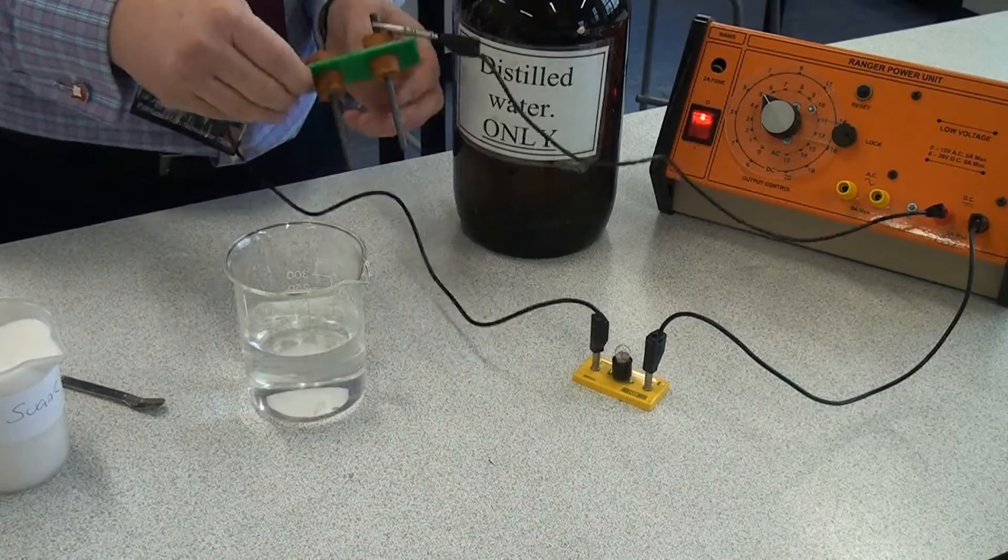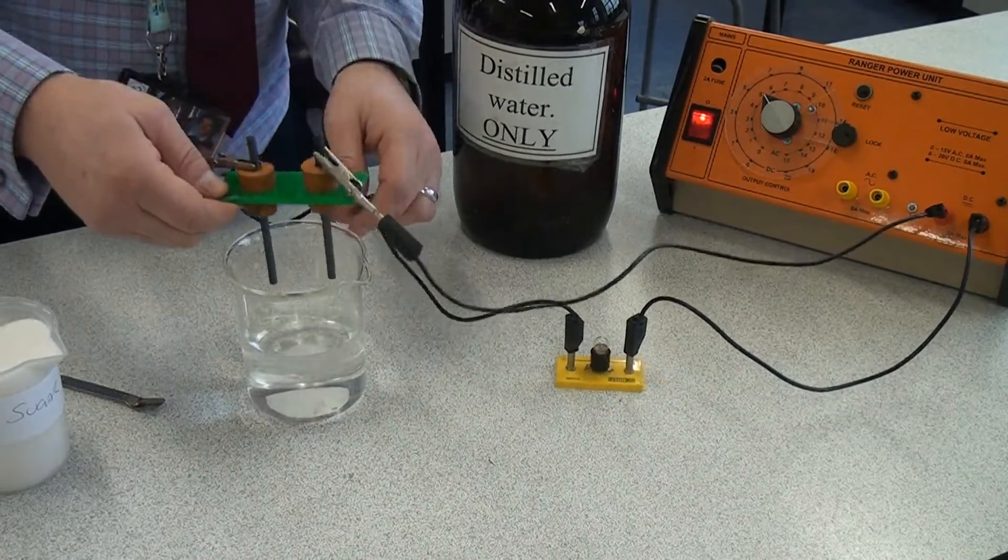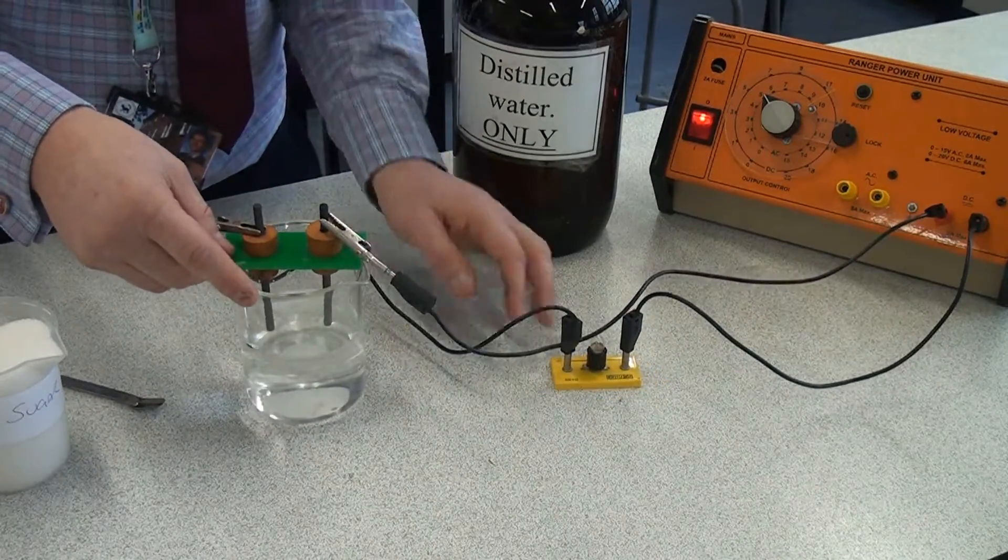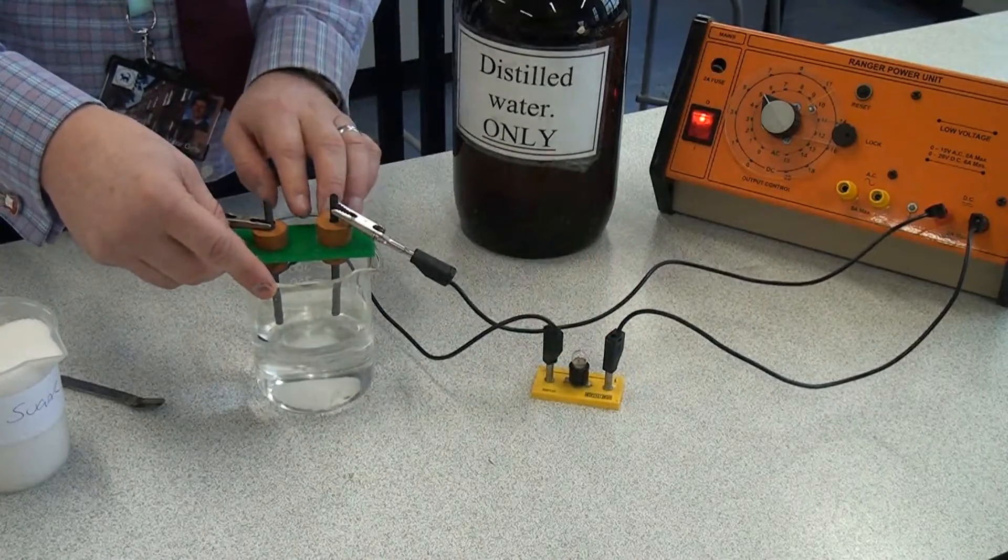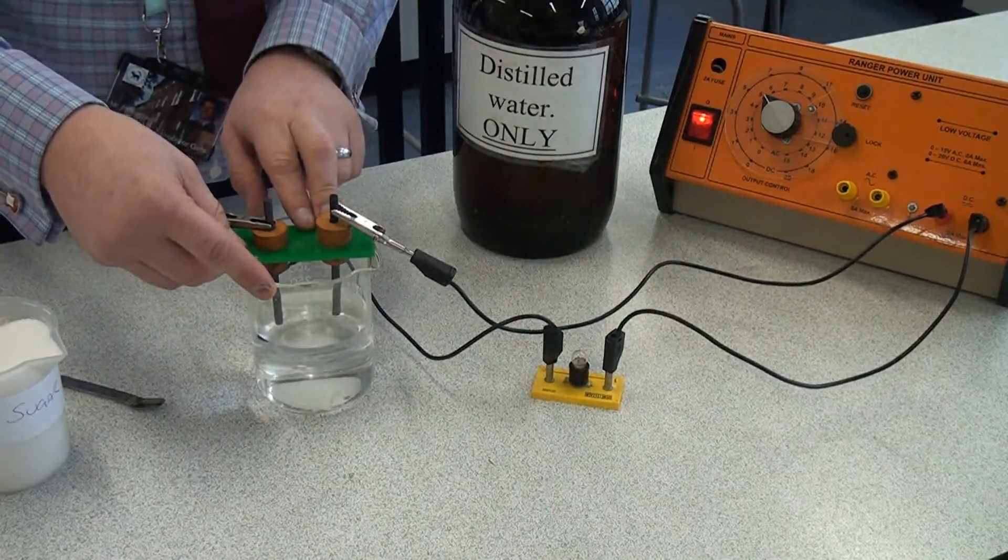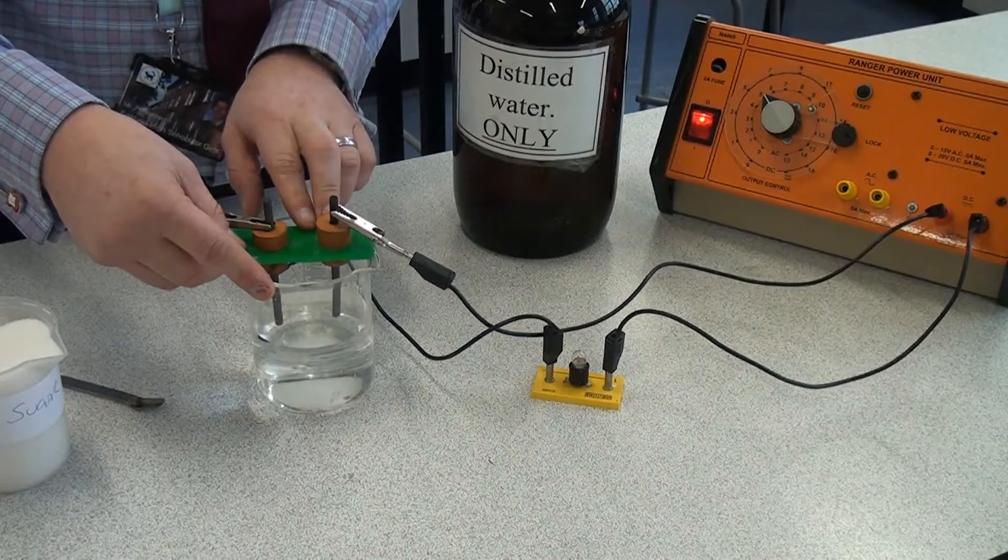So let's see if the sugar solution conducts electricity this time. And we can see the bulb still isn't lighting up. So even in solution the small covalent compounds still don't conduct electricity.